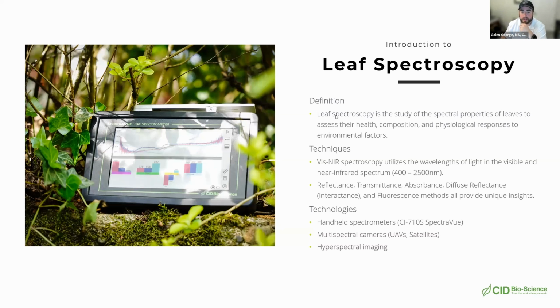The next question is, has the Spectravue been used in viticulture? Are there interesting applications for it in this field? Thank you. So that Spectravue device itself, I don't know of anyone that's using it yet in viticulture, but spectroscopy in general is being used extensively in viticulture, more specifically on the grape side of things. But if you are actually looking to test the health of the plants themselves, then this is going to be a great tool for use in that.